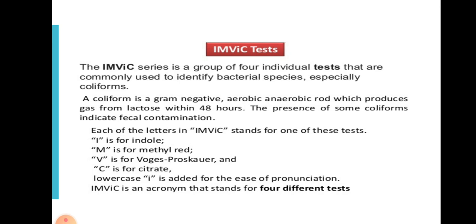This particular test is used to identify coliforms. Coliforms are gram-negative aerobic or anaerobic rods which produce gas from lactose within 48 hours. The presence of some coliforms indicates fecal contamination.